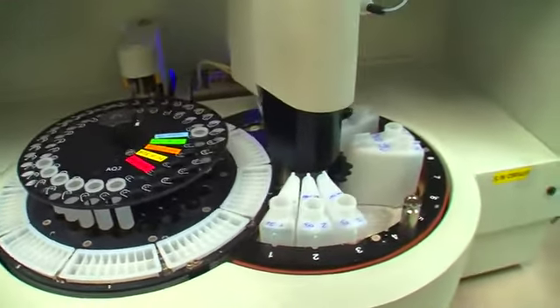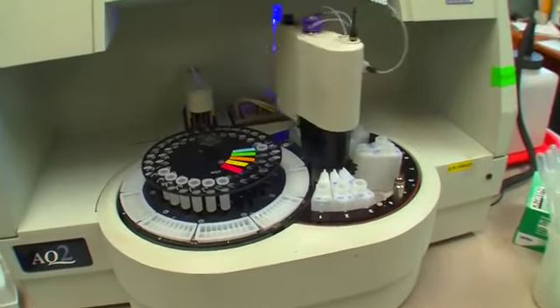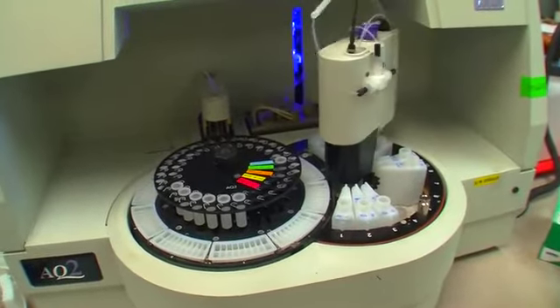So did you say nitrate twice, or was it nitrate and nitrite? And are they different? Nitrate and nitrite. Okay. They actually have two different MCLs, maximum contaminant levels. For nitrate, it's 10 parts per million, or 10 milligrams per liter. For nitrite, it's 1 part per million, or 1 milligram per liter. But each of those standards has to be met. So we have the ability to test for both of those using this one instrument.